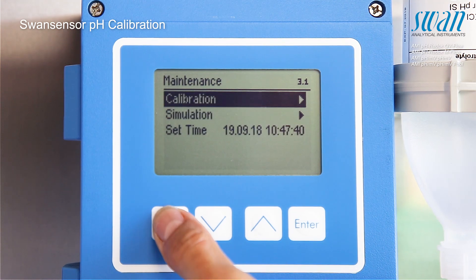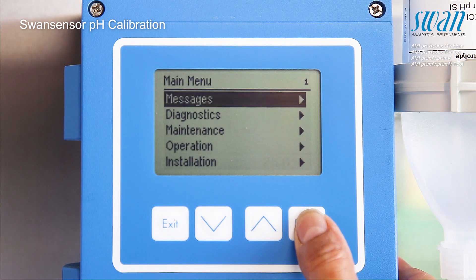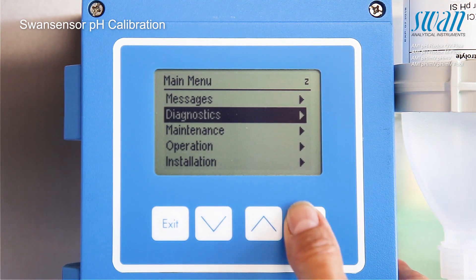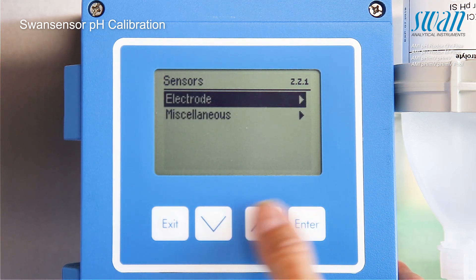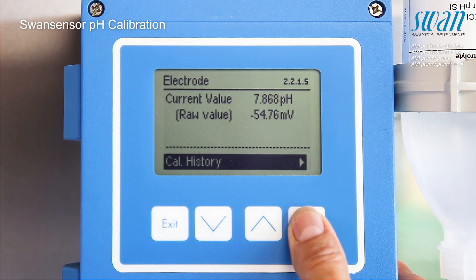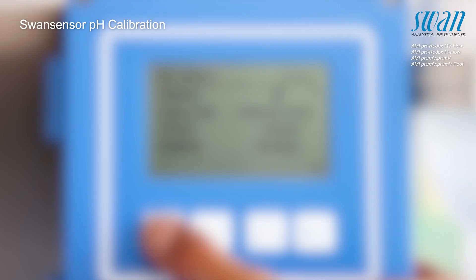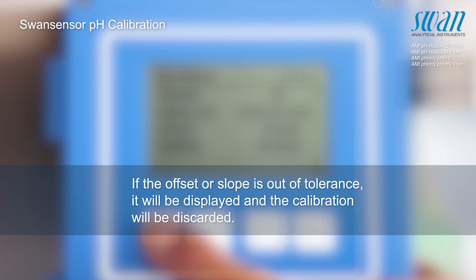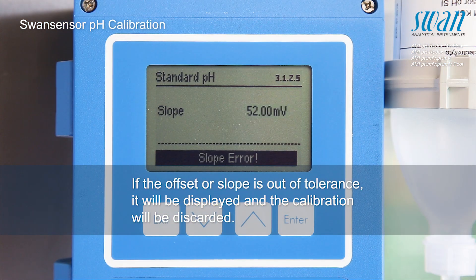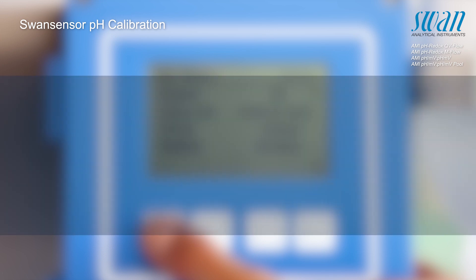The calibration values can be checked at any time. The values of the current and previous pH calibrations are displayed as shown here.